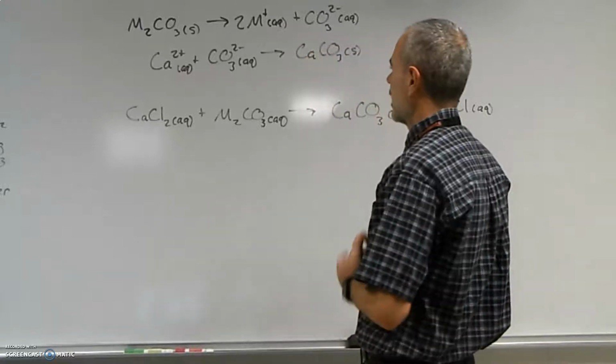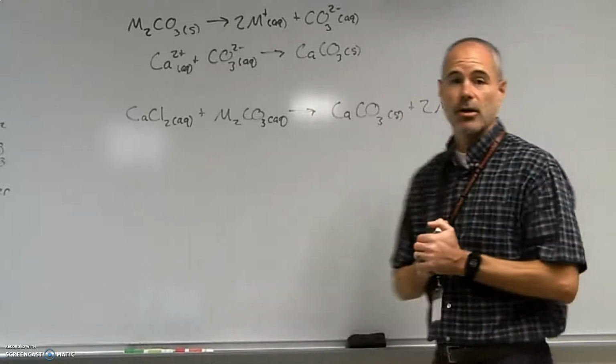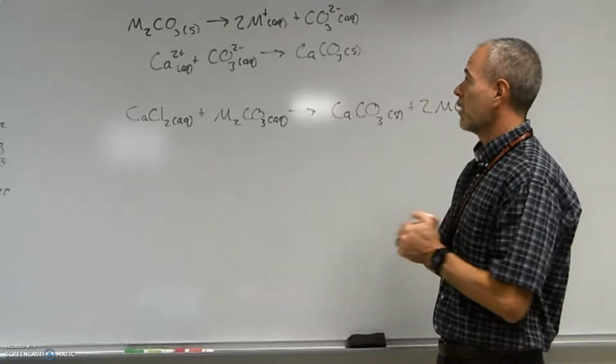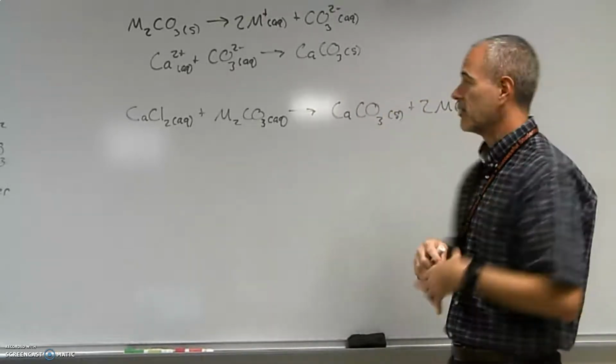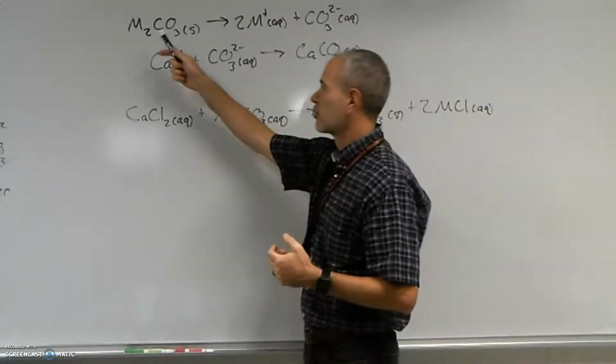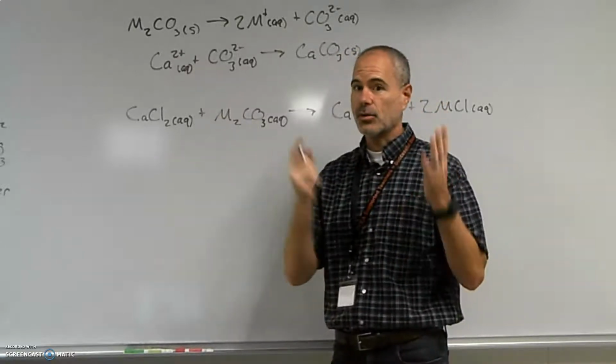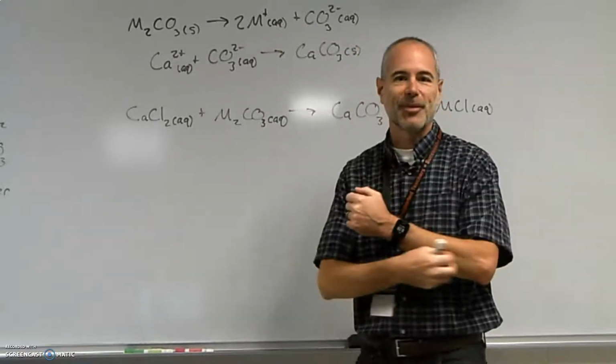Okay, we're going to look at the gravimetric lab and some of the parts that are going to go along with that. So you have three main equations on your sheet, if you take a look. And the first equation is just looking at this group 1 metal carbonate. That's what we're trying to identify. What is that group 1 metal carbonate?